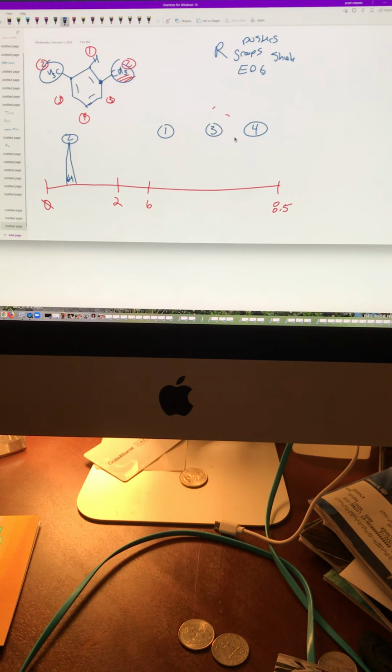You ready to go? Signal 1. What do you got, signal 1? Next door, I see 0 plus 1. Say hello to my little singlet. Got it? No neighbors. 0. Lonely guy.